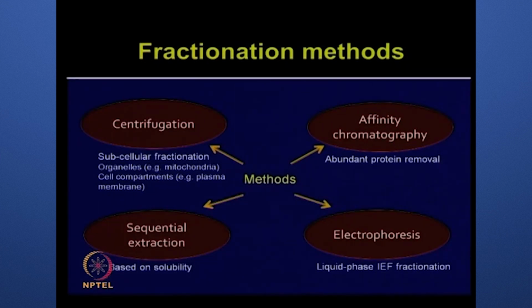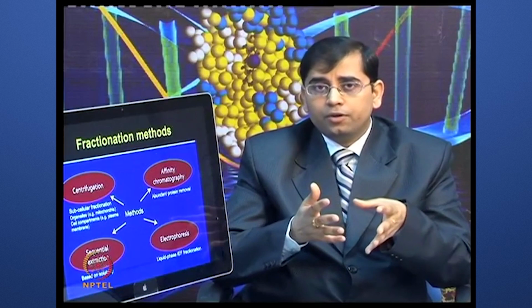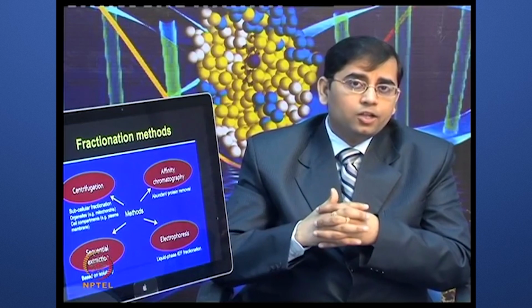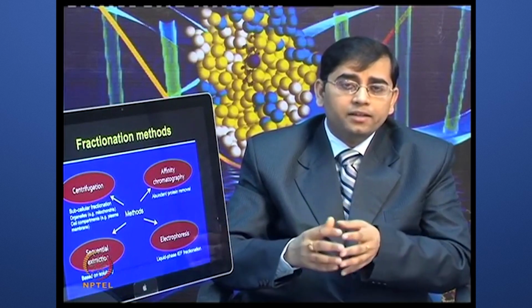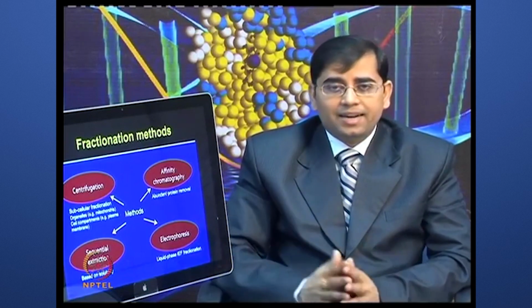Sequential extraction, which again is going to simplify your proteome, is based on solubility, and different types of chemicals are used so that in a sequential way one can extract the proteins. A few proteins may be more soluble in one particular composition of reagents, and other proteins are more soluble in a different solubilization buffer. So, by applying different recipes of chemicals, one can obtain bigger coverage of the whole proteome by doing sequential extraction.